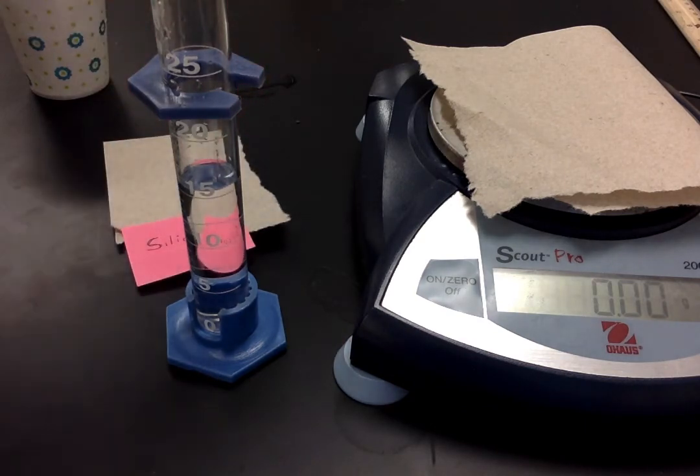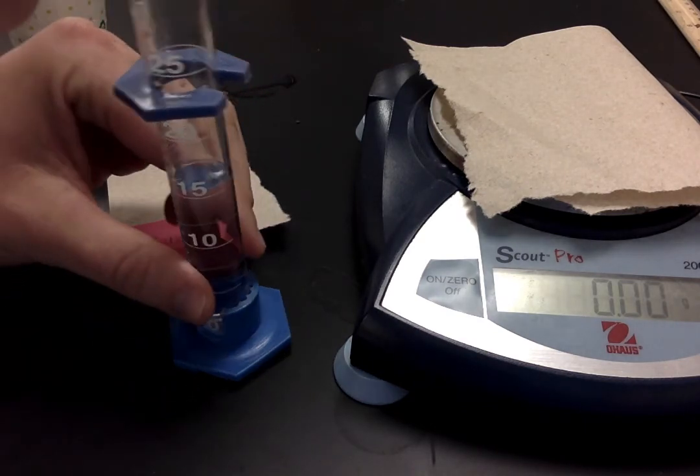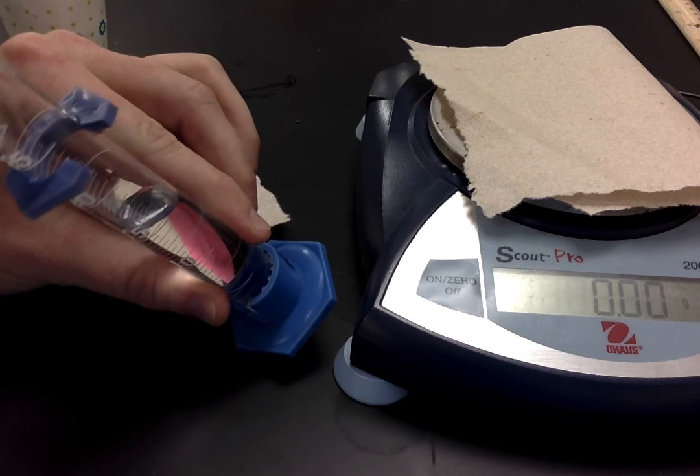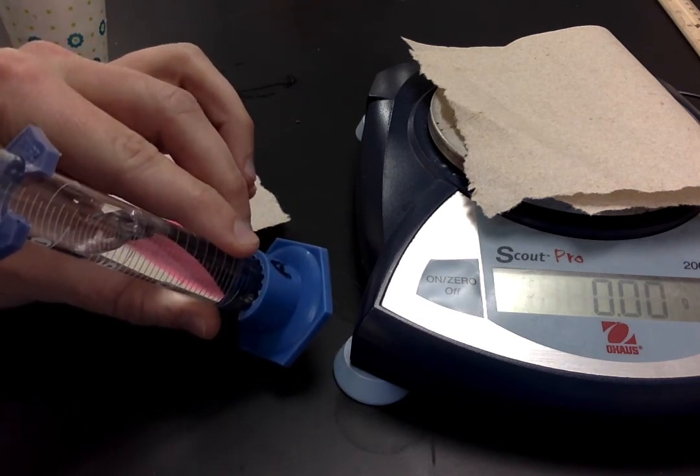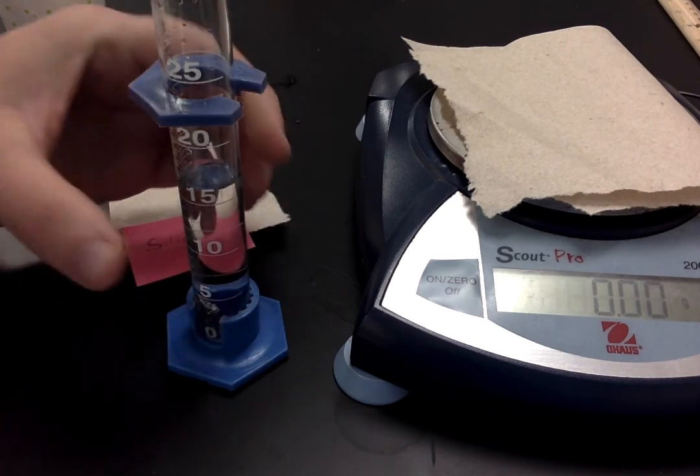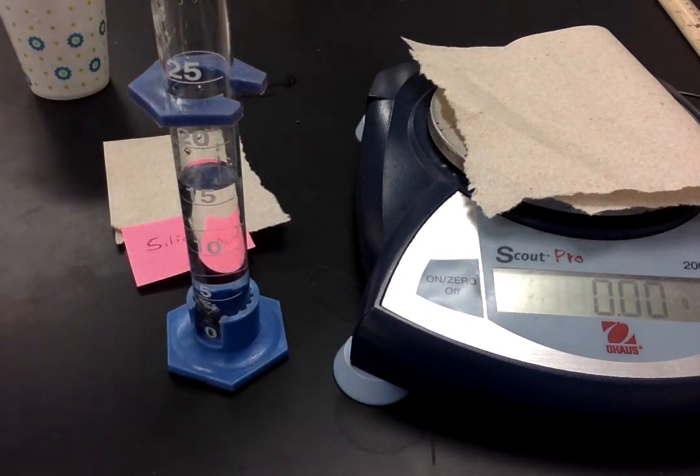Okay, so now I'm going to take that silicon. I'm going to gently put it in the graduated cylinder. Oh, you want to do it gently so that it doesn't make too many bubbles because that will affect your measurement.